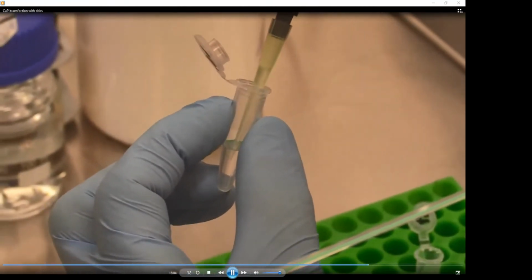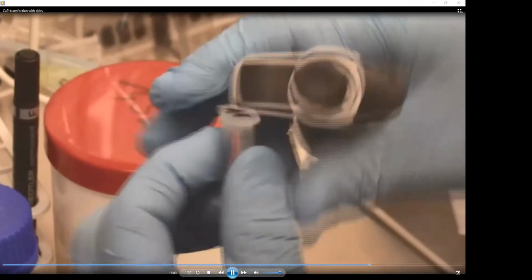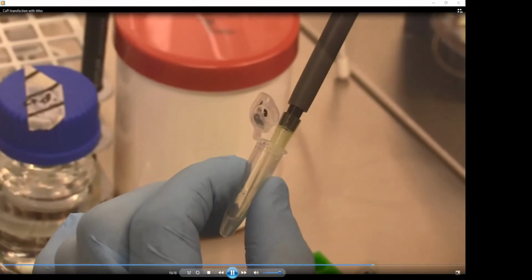Okay, so this is this 15 times mixing of the sample. This has to be done with all samples naturally.